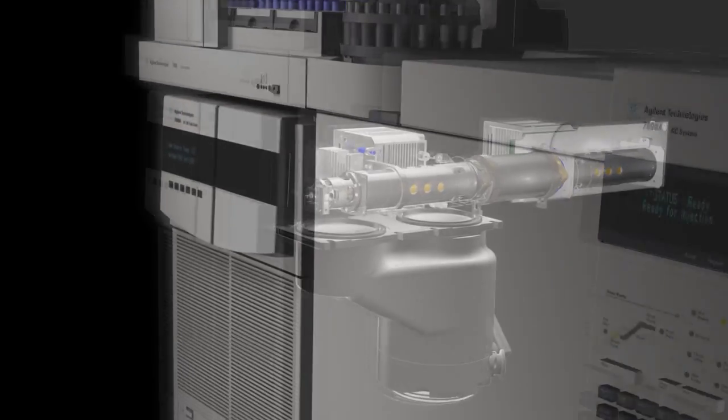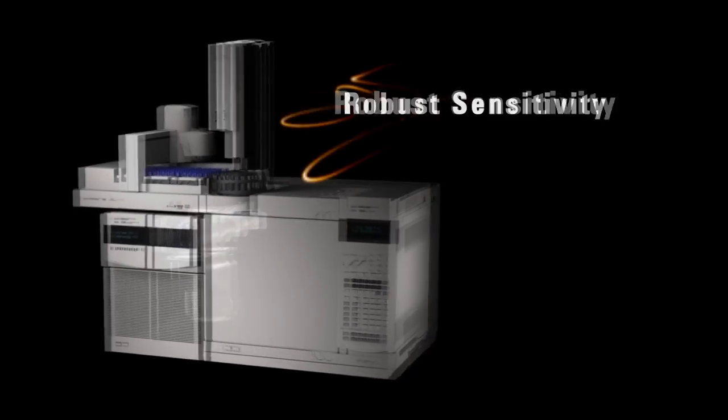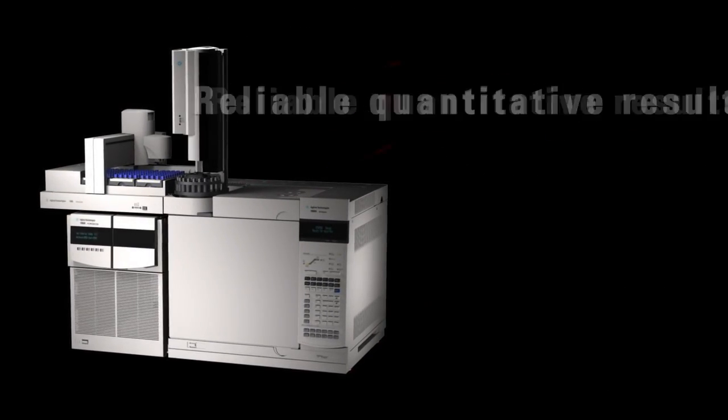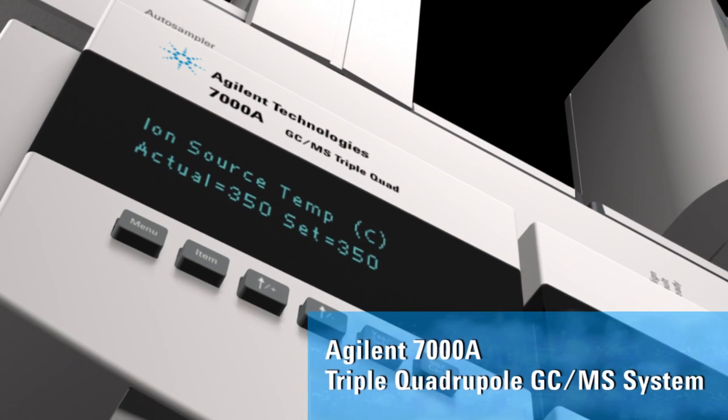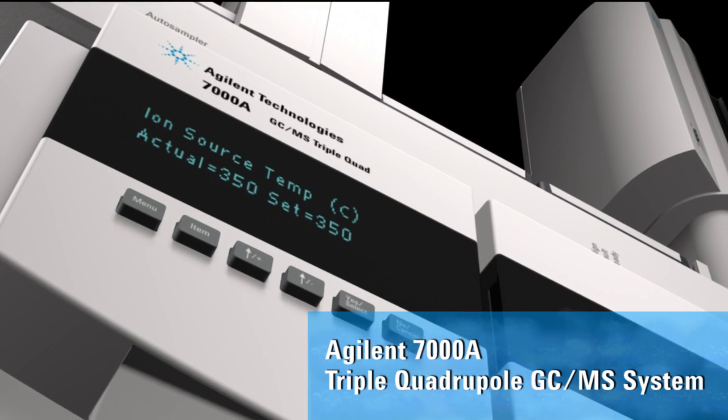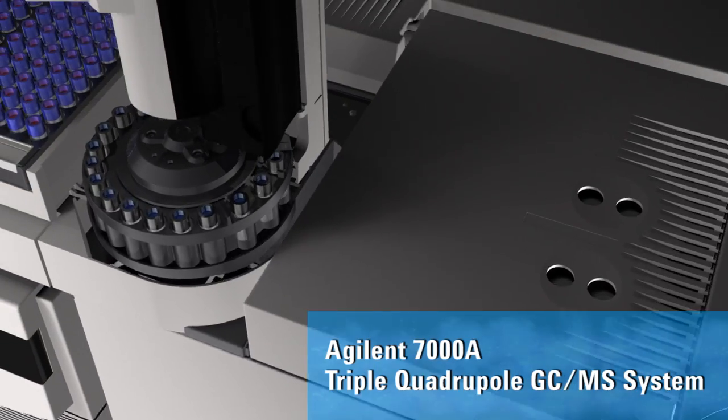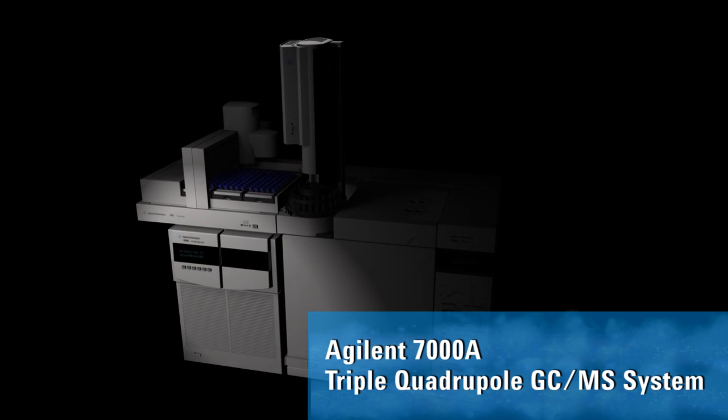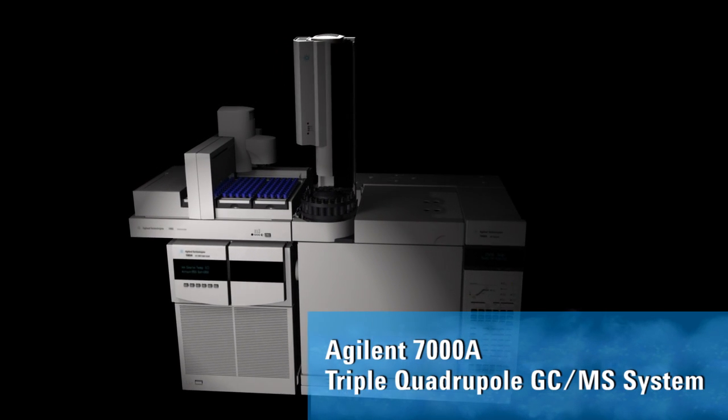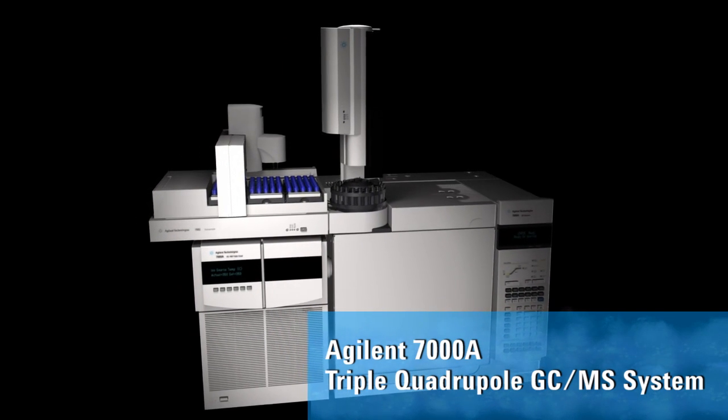The 7000A system has been carefully designed to deliver robust sensitivity and reliable quantitative results. The Agilent 7000A quadrupole GC-MS-MS system. An MS-MS optimized for trace analysis of your most complex GC samples. The new standard for GC-MS-MS performance.